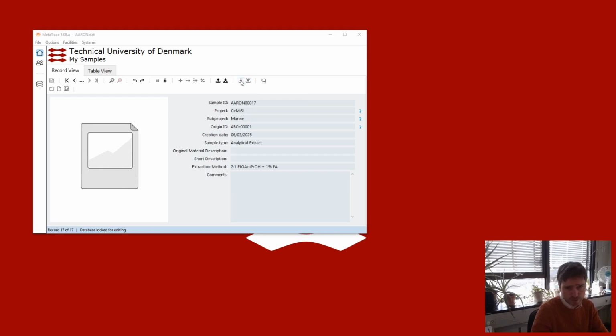So that's those download buttons. We'll still come back to these uploads, but first we can take a look at this button here. This is where we need to access our own database. This is when we want to access our Collaborators' databases. This here is a separate set of databases that are data systems.